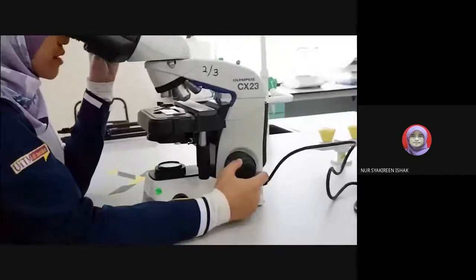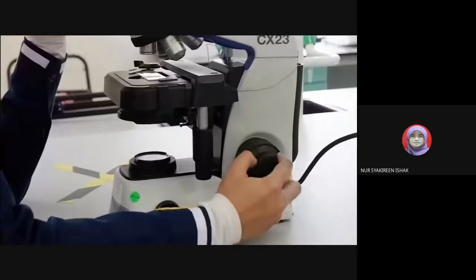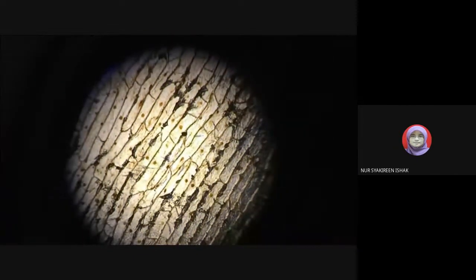And then you can use the fine focus. Make sure that the image is clearer. This is what you will see under the microscope.